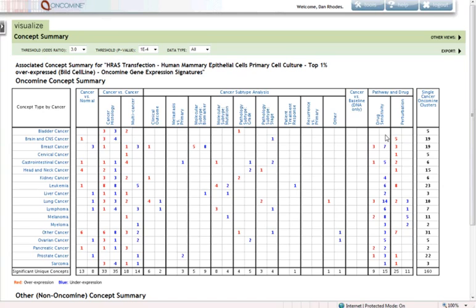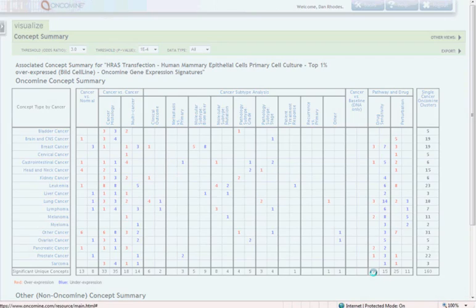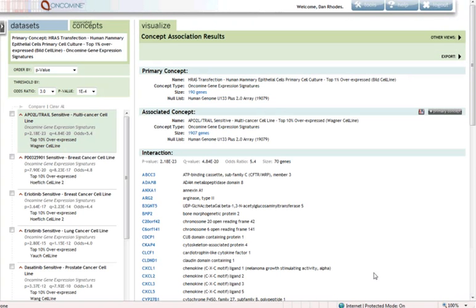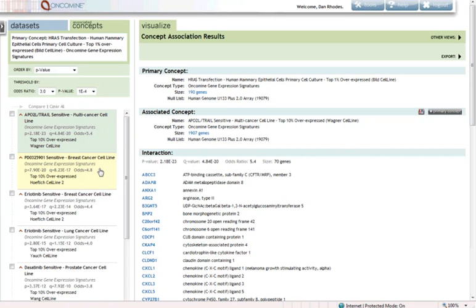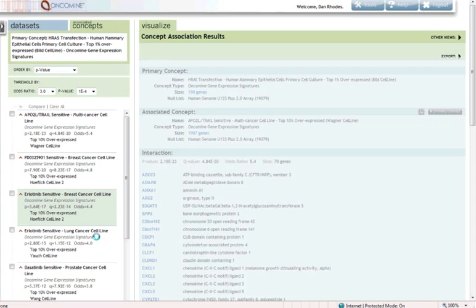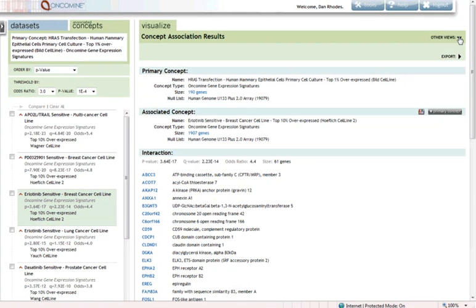If we were interested in drilling down, again, we could say what drug sensitivity analyses is RAS pathway associated with? And we can see here from this analysis that sensitivity to the APO2 trail, apoptosis ligands, is associated with RAS pathway activity, as is sensitivity to a variety of targeted agents, like the PD compound, the MEK inhibitor, as well as to erlotinib sensitivity in independent studies.